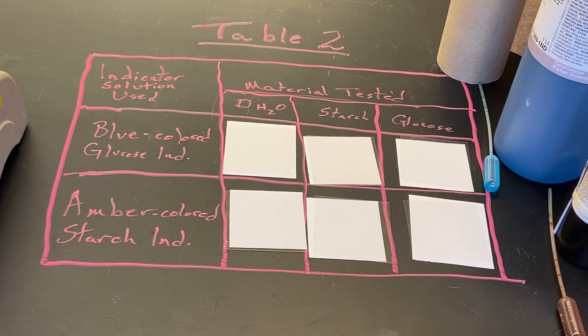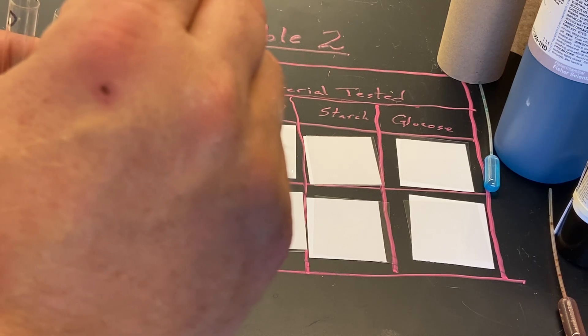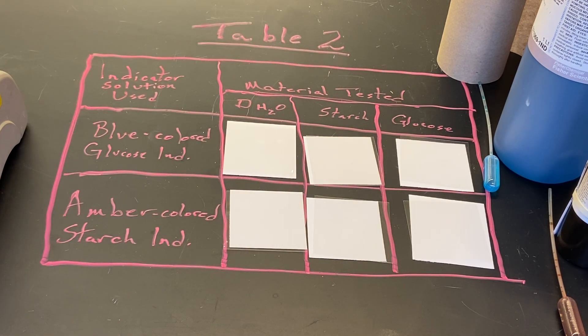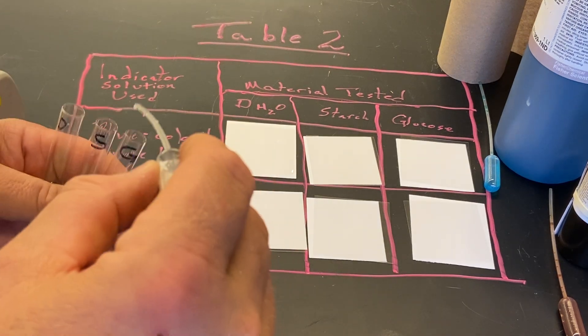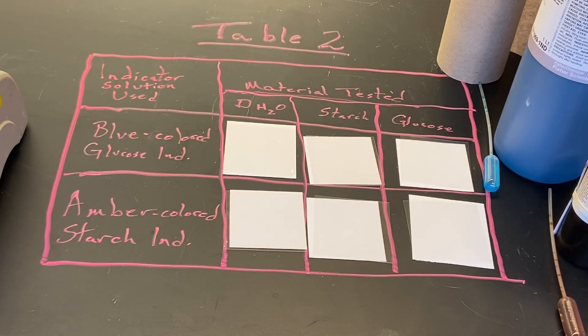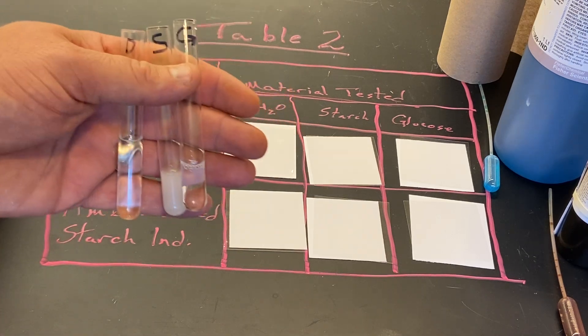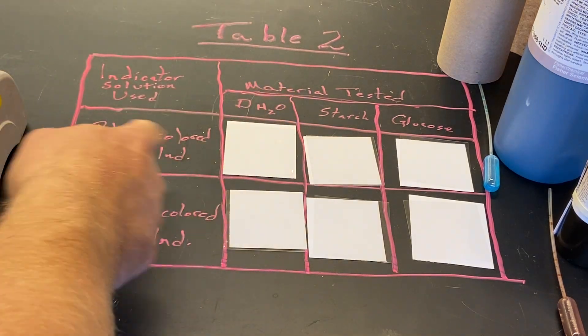Then some glucose in the G tube. I have pretty much comparable amounts. To test with the blue colored glucose indicating solution, you have to heat it, so we're going to put about 10 drops of that solution in each tube.